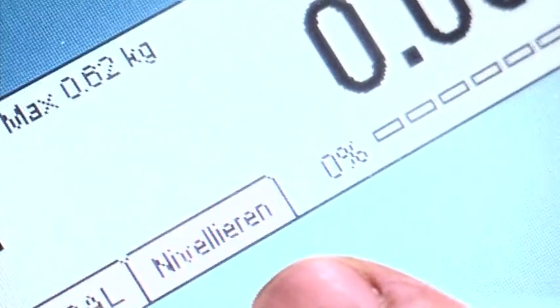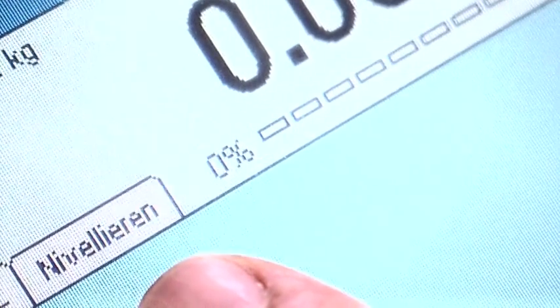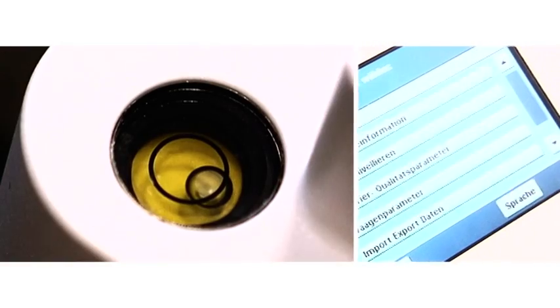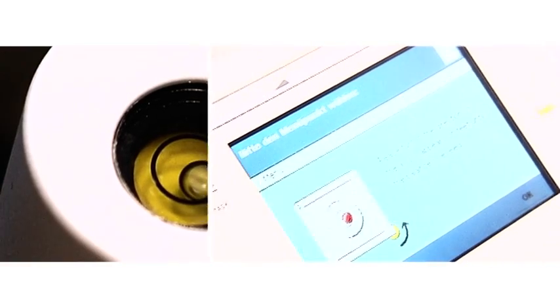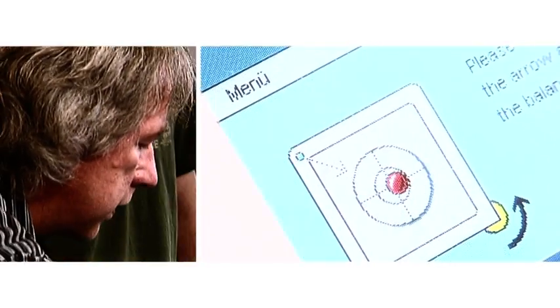We know that operators want the leveling of a balance to be as simple as possible. So with this in mind, we developed an automatic leveling system.